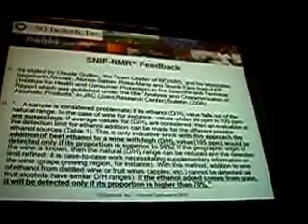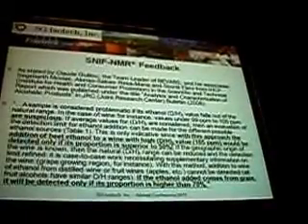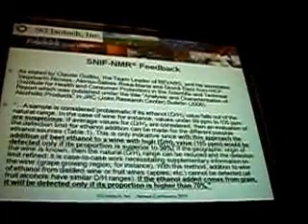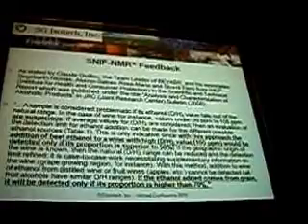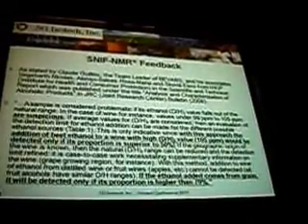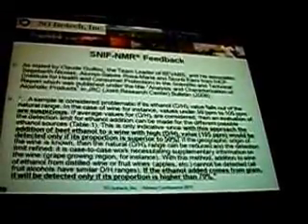So this is the feedback for SNIF-NMR, as stated by Claude Guillou, who is the team leader at Ispra, and his associates, and it was presented in a Scientific and Technical Report, which was published under the title Analysis and Characterization of Alcoholic Products in the Joint Research Centre Bulletin in 2008.